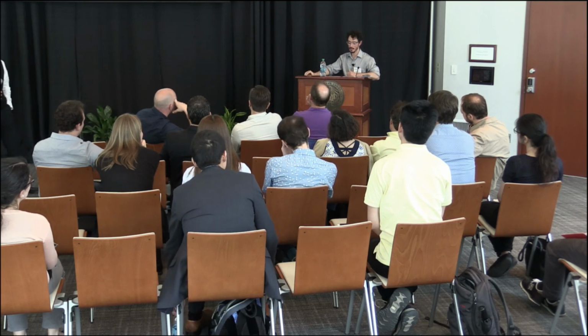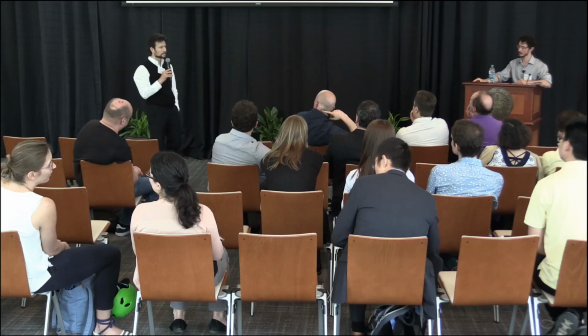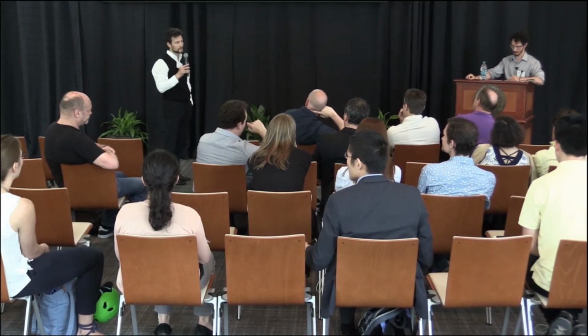That's a great question. Obviously, we've tested 3 cell types so far, but I guess the ultimate answer, before I make up more, is basically we haven't tested it. We're hypothesizing so far that any cells you can get into a suspension, it will work well for any mammalian cells, any vertebrate cells that you can get into a suspension. But obviously that remains to be seen and tested. I don't think we're going to be doing neurons with this technique. We have also used this procedure with fairly large bulk samples, with which we could use another procedure and clean them up, but this is so much easier and simpler that we just prefer it over all the other preps, if you have cells that can indeed be lysed as well.